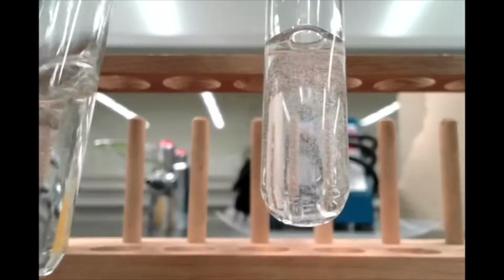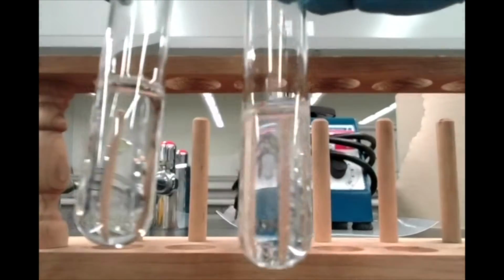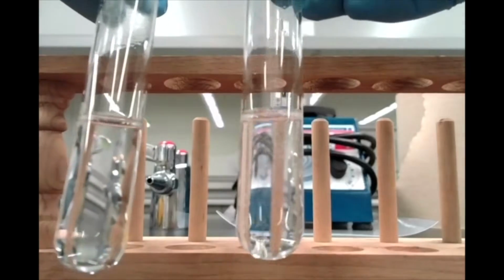So you can see, if you're having trouble seeing them, the one on the right is still going. It still has the cloudiness from the unreacted sodium bicarbonate and the bubbles that are still evolving from it. Whereas the one on the left is our hot water one. You can see that it's definitely cleared up a lot faster there.